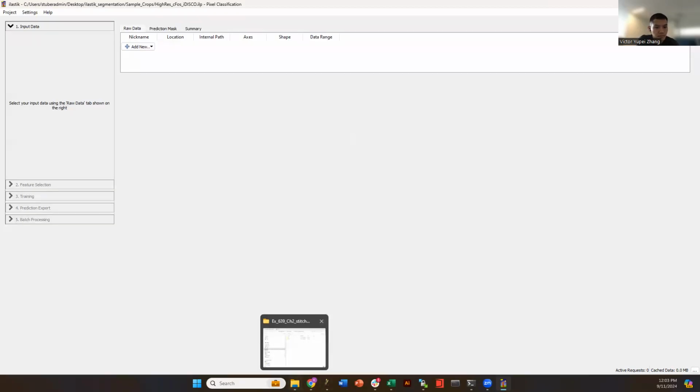What you want to do is feed in your cropped images that you generated through the script and use them as the training data set. What I would recommend is don't make a classifier for one sample. You will get multiple crop images or test images from all of your samples, and then you can feed all of those images into the classifier.